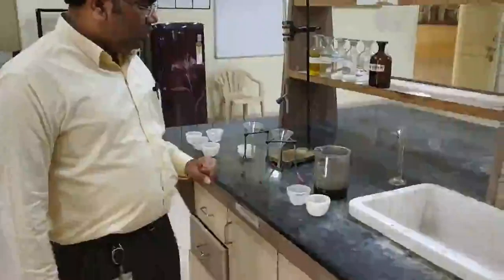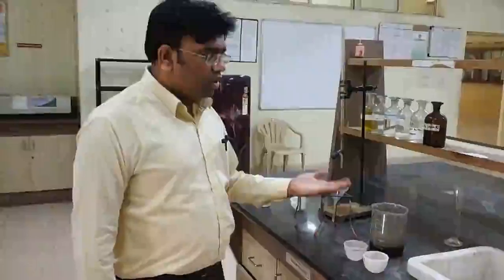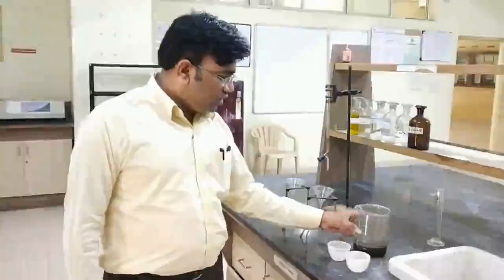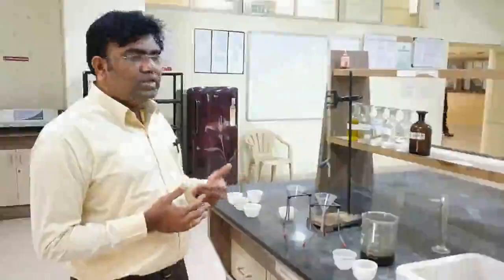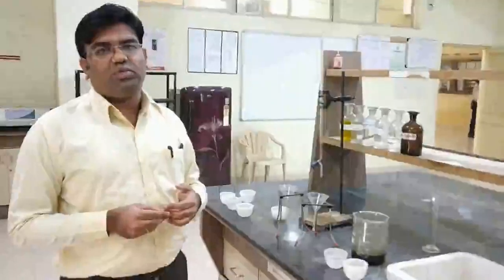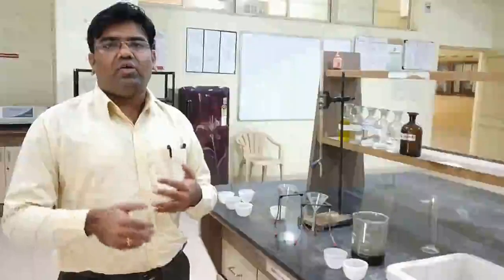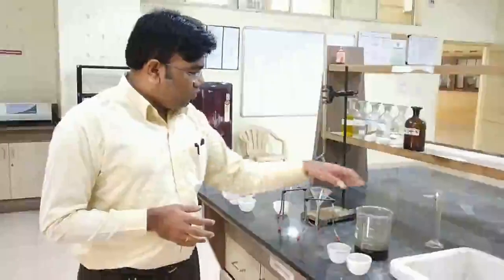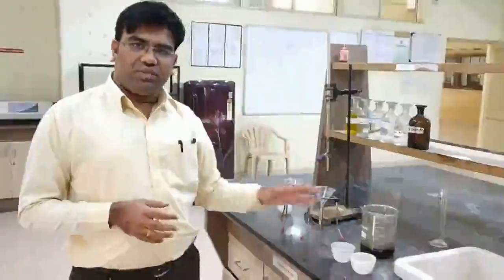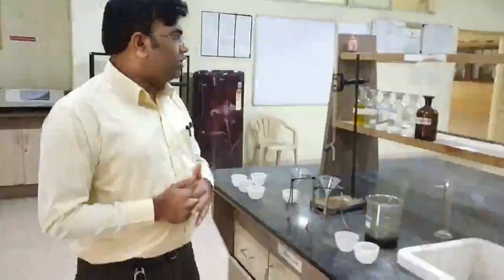Now this sample, the quantity of the sample is to be decided upon the concentration of the solids in it. Approximately, if the solids are less, then we'll have to take a 100 ml sample. If the solids are moderate in that sample, we'll have to take a 50 ml sample, and if the solids are of a higher concentration, even 25 ml of the sample is sufficient. Here we can see there are more solids in this sample, and hence we are going to take only 25 ml of this sample.